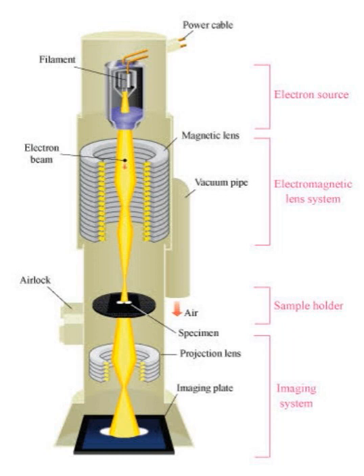The illumination source of the electron microscope is a white hot tungsten filament which emits electrons. The wavelength of the electron is shorter than that of light. The wavelength of electrons in an electron microscope can be as short as 0.004 nanometer, about 1 lakh times shorter than the wavelength of visible light.